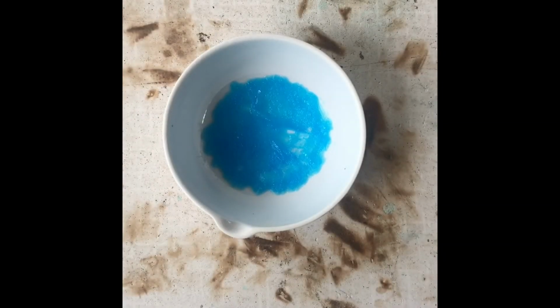And here's our final product. Just a teeny tiny bit of water left in the bottom of that will evaporate in time. But essentially in this evaporating basin we now have pure copper sulfate. We started with copper oxide, insoluble, and reacted it with sulfuric acid. We filtered off the excess copper oxide, and that left us with copper sulfate and water, and we've evaporated the water to have pure copper sulfate crystals left.